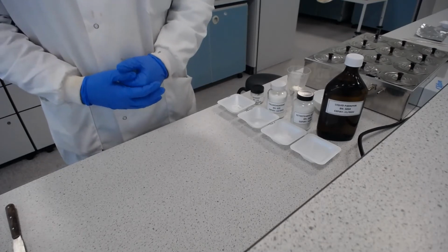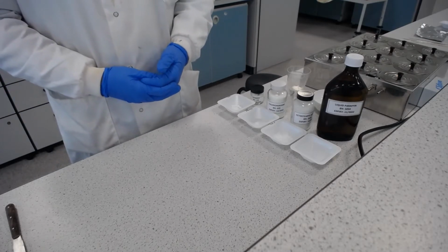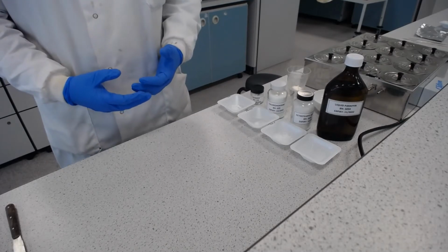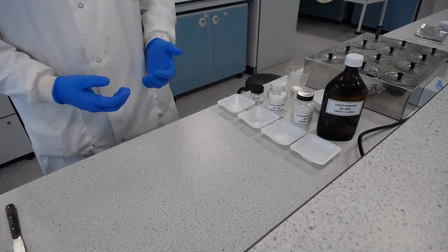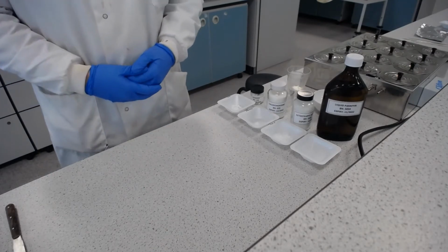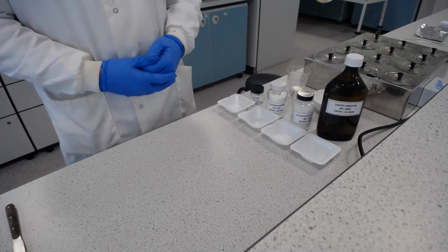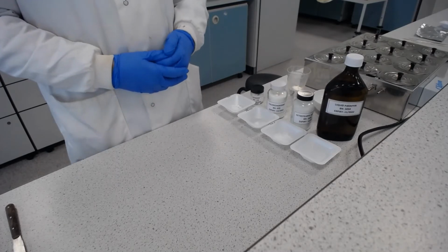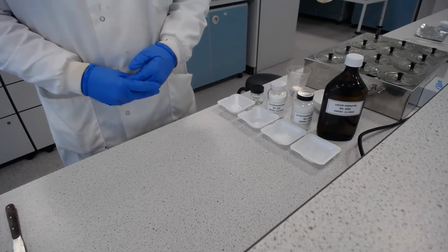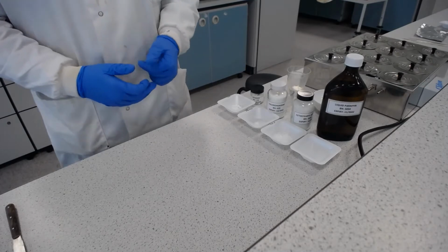But remember that we need to make an excess because we won't be able to scrape every last bit of cream off where we're making it. So we're going to put a 5 gram excess in. So we're going to be working out how much we need for 30 grams. So you can either do that with a calculator, or you can divide by 10 from the master formula and then times by 3, which will get you to the 30 grams needed. I've actually weighed out twice the amount that I need for that, so I've weighed out enough for 60 grams, and that's because at the end I'm going to show you how to put this into two different sorts of containers. So the next step is to weigh the tube or pot, including the lid, and to record its mass.